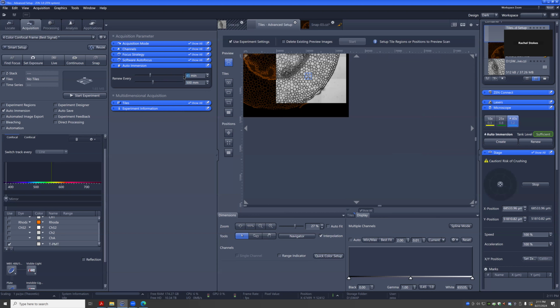But this will be time. So say every 45 minutes it adds, and it'll run the renew volume, not the create. I'll look up what that is because it should be listed somewhere. But basically, this is your time indication and this is distance.